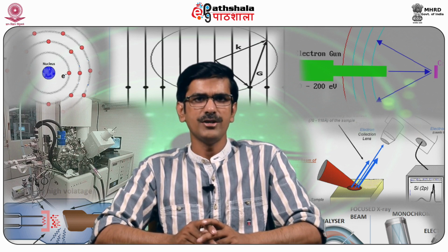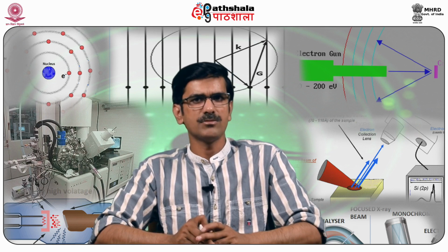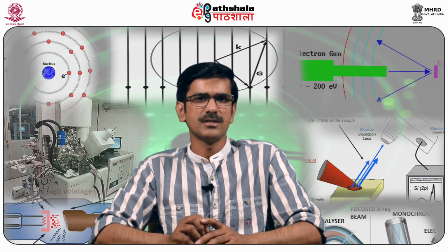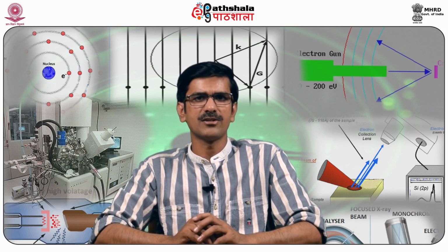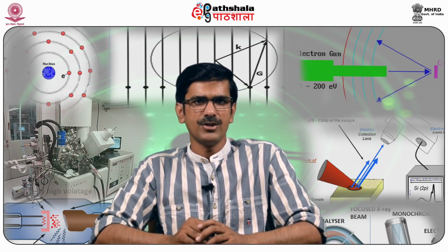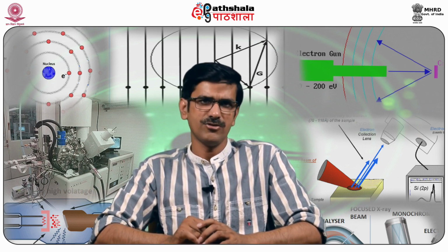In order to actually get well resolved useful data, other components must be introduced into the instrument. To improve the resolution and intensity of the system, optics is added to the PES instrument. Electron optics are able to de-accelerate the photoelectrons through retardation of the electric field, and this energy is known as pass energy. The de-acceleration helps in raising the resolution but lowers the sensitivity also.